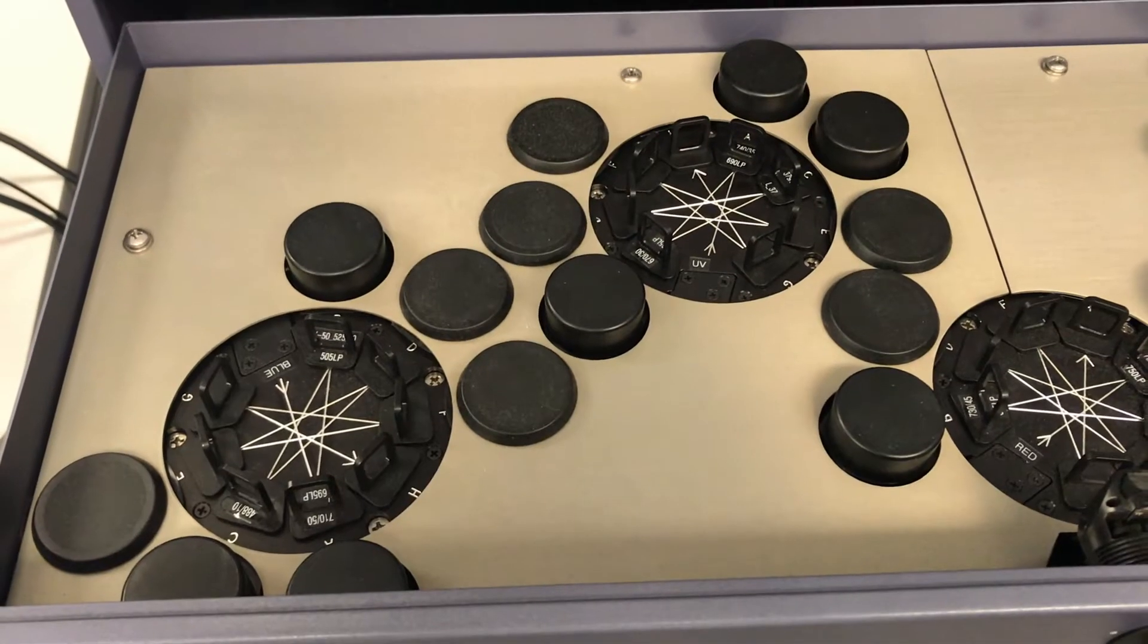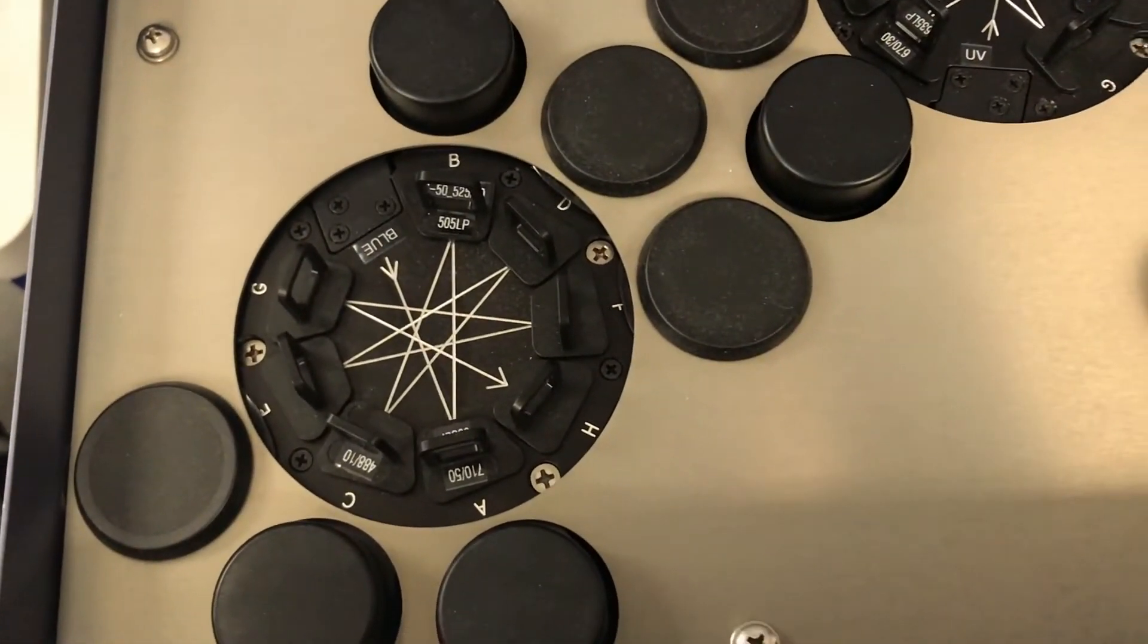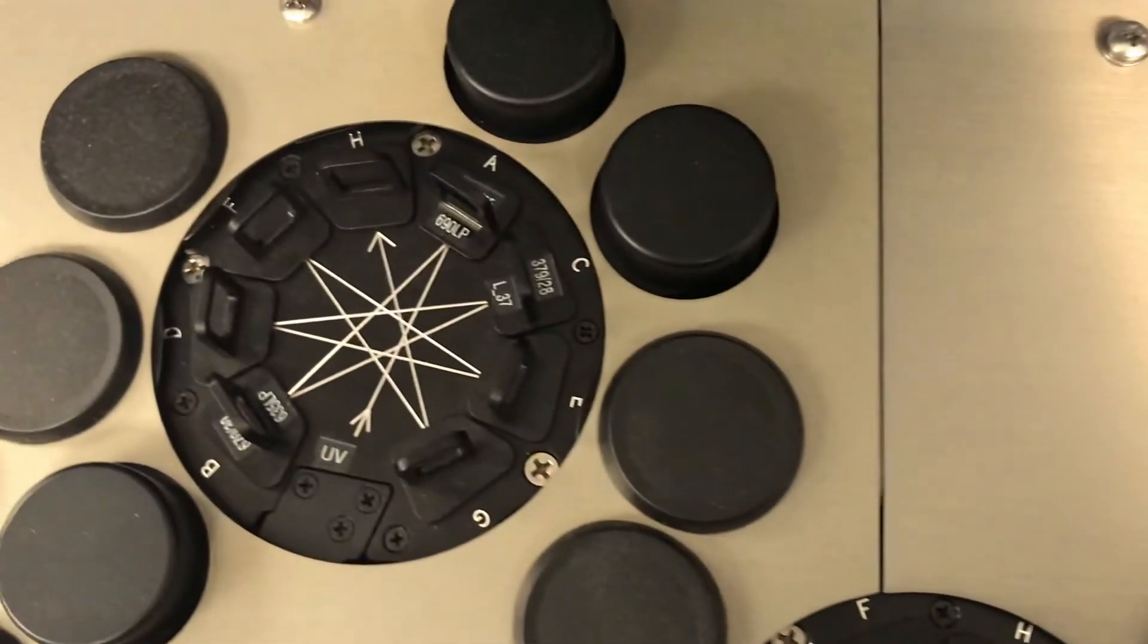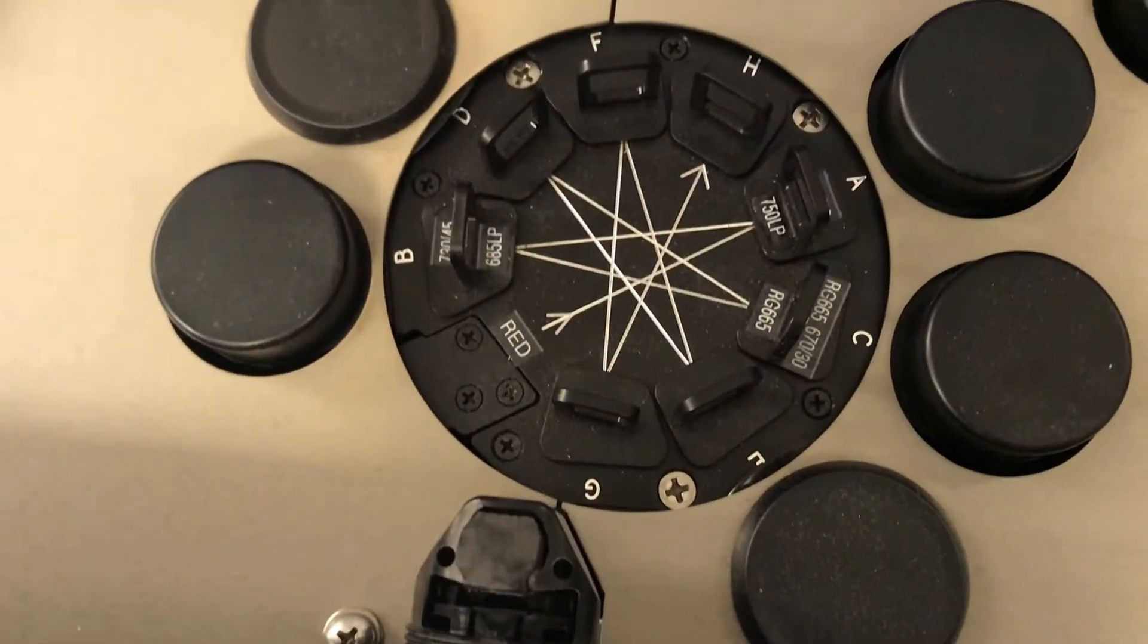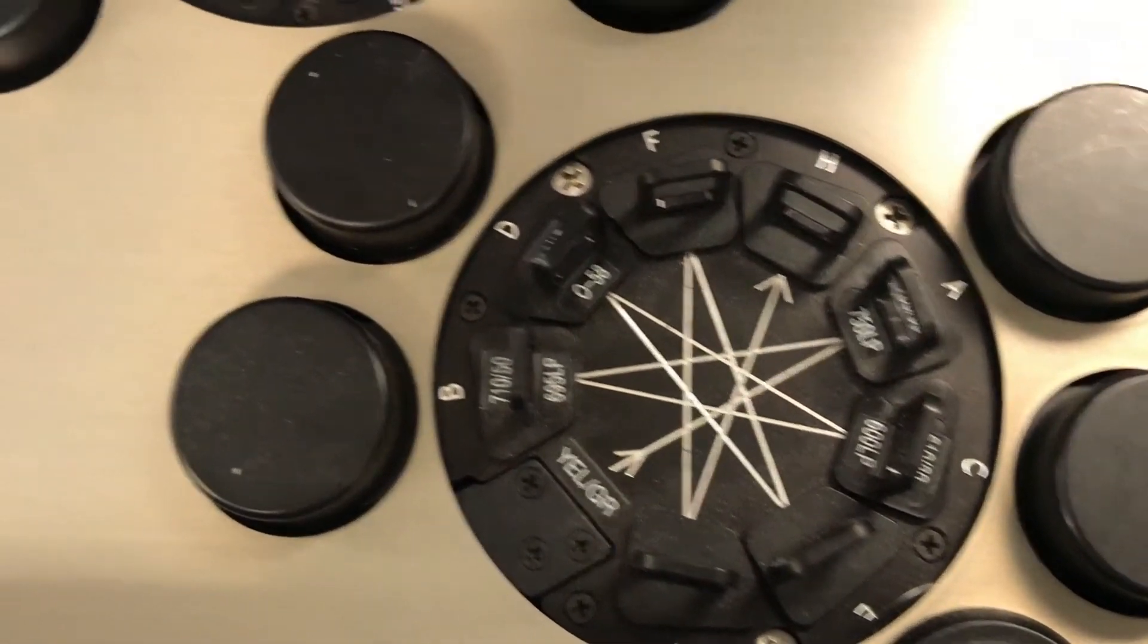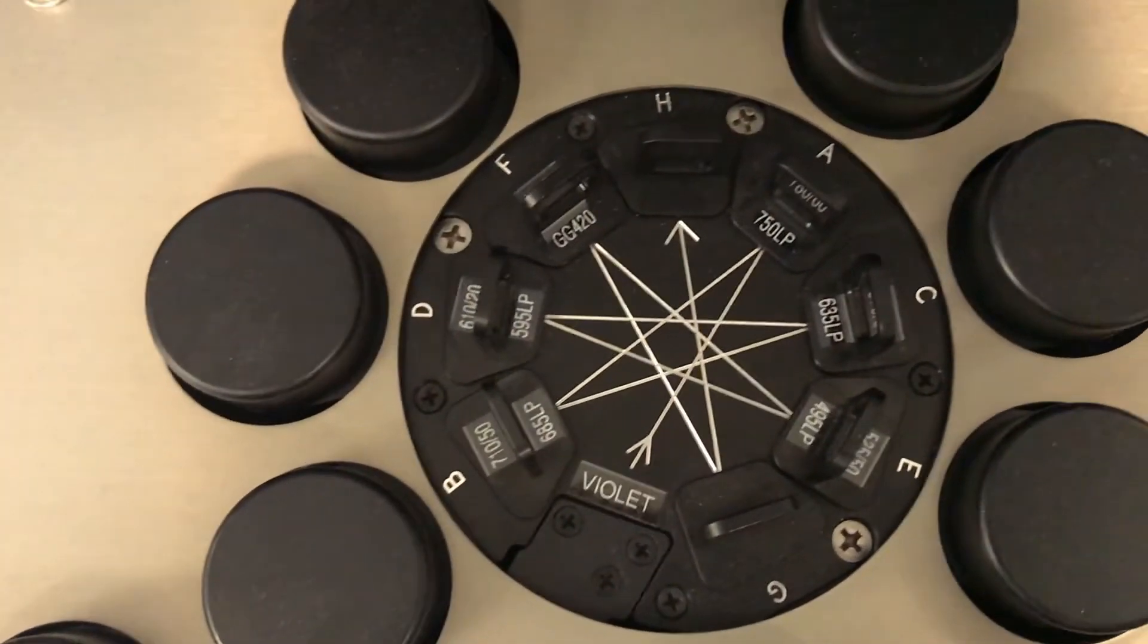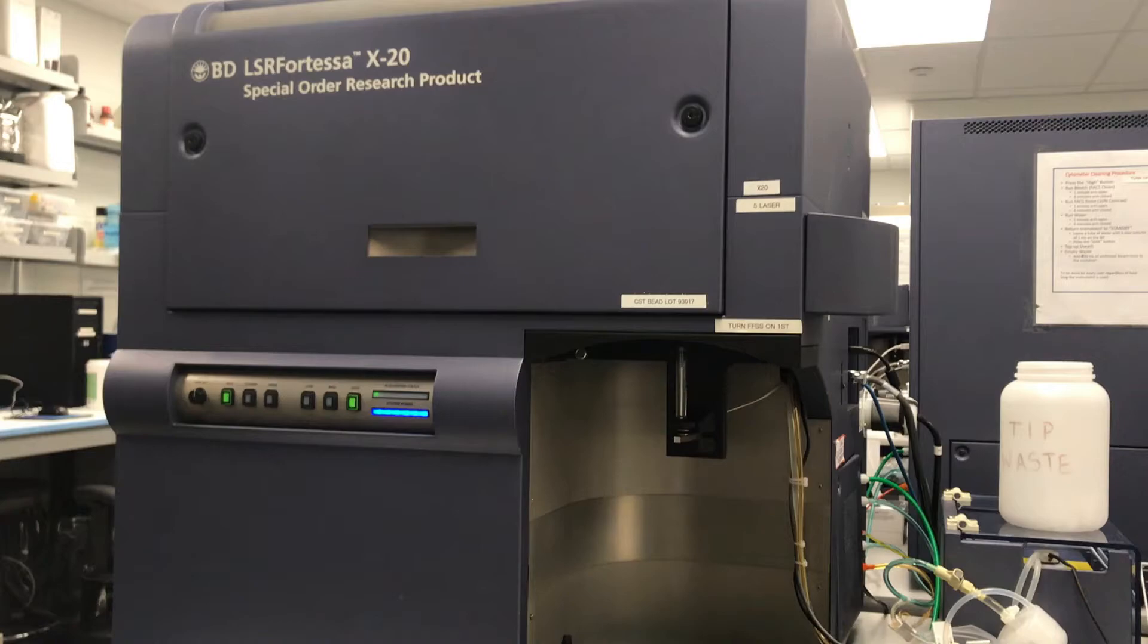The examples here are using X20 for TESA from BD company. As we can see, there are different lasers. The first one we're seeing over here is a blue laser. The second one is a UV laser. The third one over here is a red laser. And then the next one is a yellow-green laser. The last one we're seeing over here is a violet laser. These lasers all have different filters.